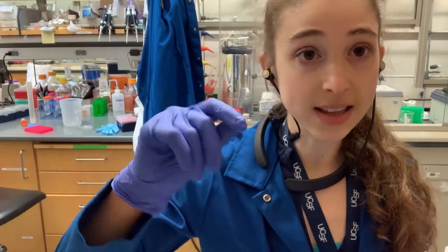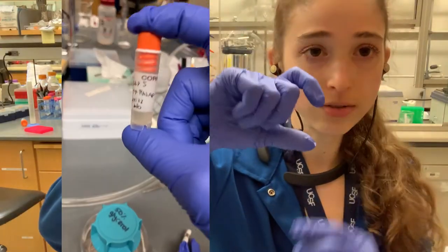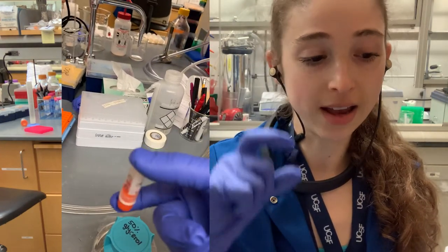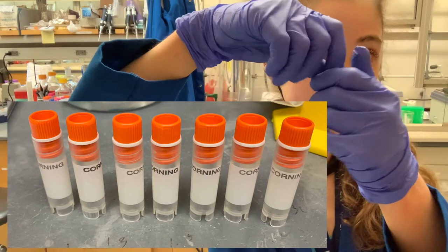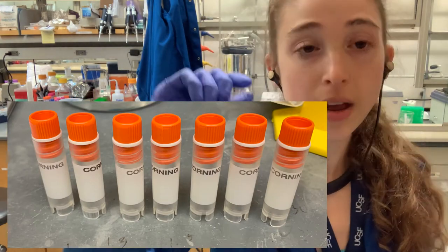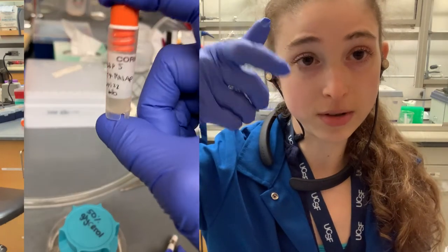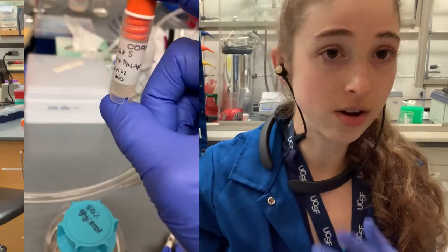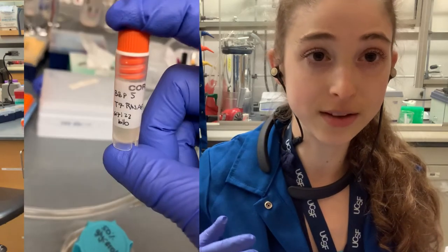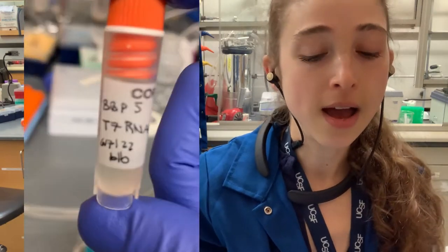Mix the culture with the glycerol in one of those cryo vials — the ones with the spin top that are good for the minus 80 freezer and won't crack open. Just invert to mix. The glycerol will help protect the bacteria by providing osmotic balance so the bacteria don't just break open when frozen.